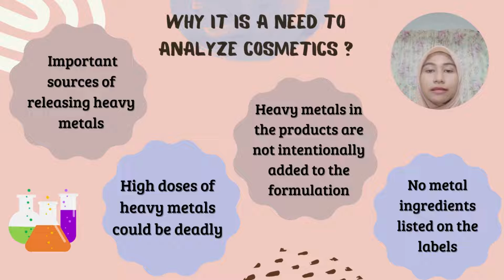Impurity is a substance not intentionally added to a product, but rather is either a byproduct of the manufacturing process formed by the breakdown of the ingredients, or it may also be from the environmental contaminants of raw ingredients. So next, I'll be explaining the procedure in determining the concentrations of heavy metals in cosmetic products by using spectrophotometry.